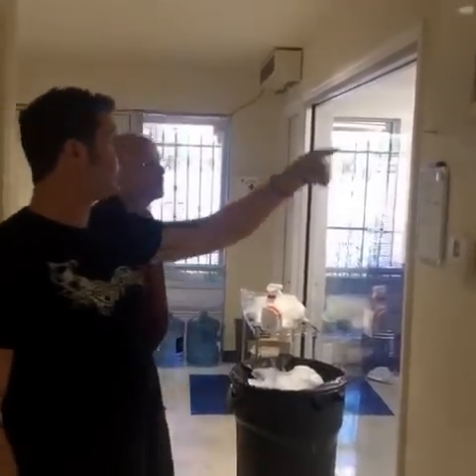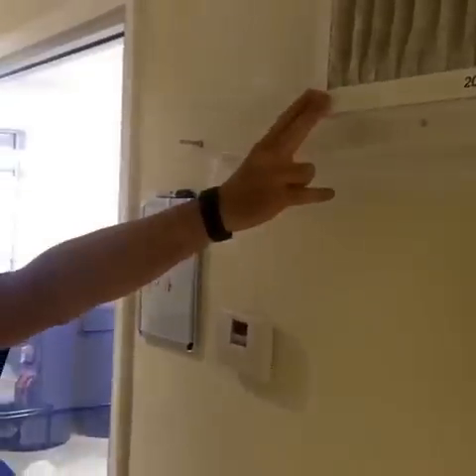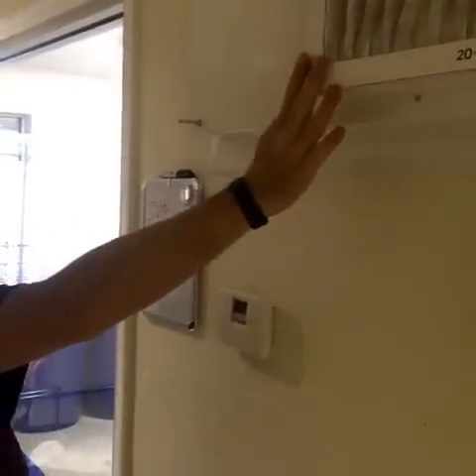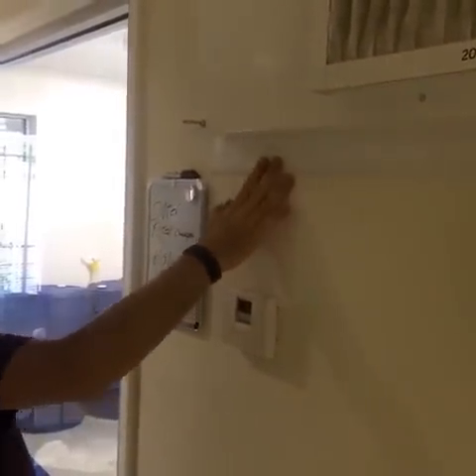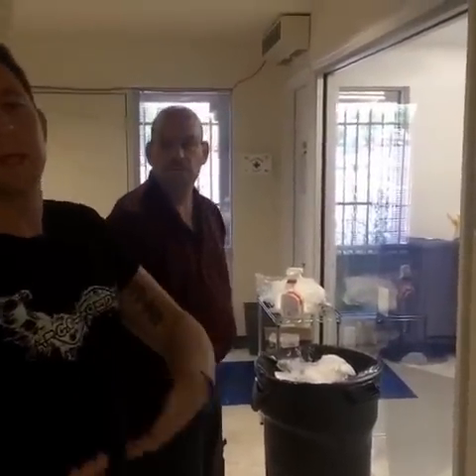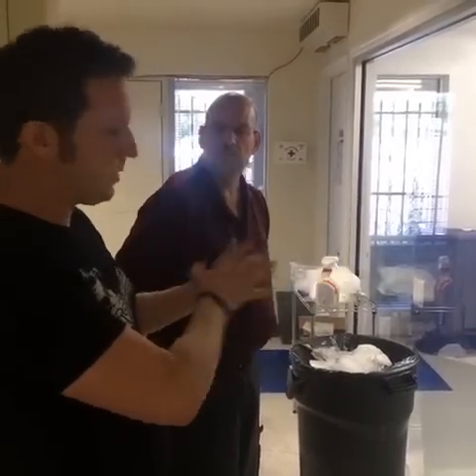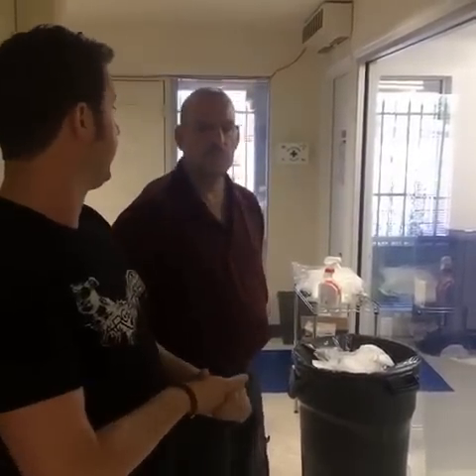How often is this changed? This outer filter here is changed once every month. That's just a light standard filter. The filter inside we have changed about every 6 to 8 months. And what do you do, and we'll take you guys into the actual lab itself, but what do you do in terms of daily and weekly cleaning of the facility itself?